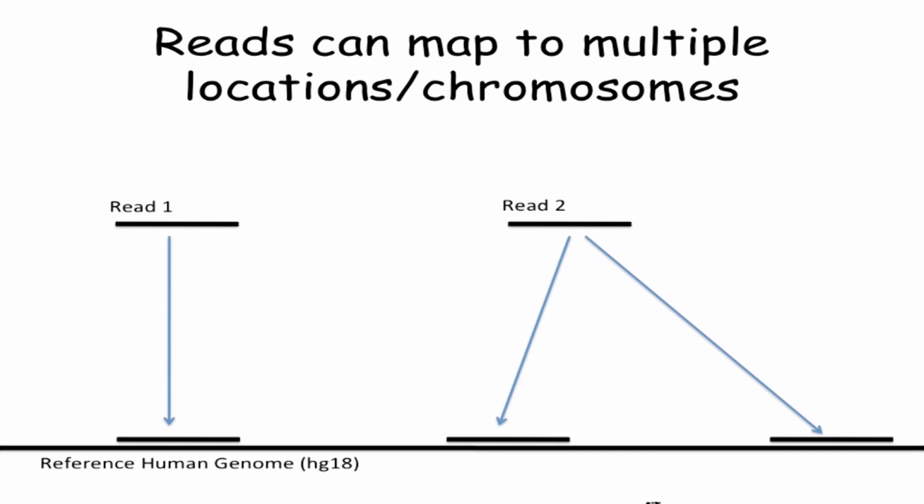The fact is that these efficiencies are changing because programs are also improving all the time. But BWA used to be slightly better at allowing indels in your reads, essentially taking into account short insertions or short deletions.